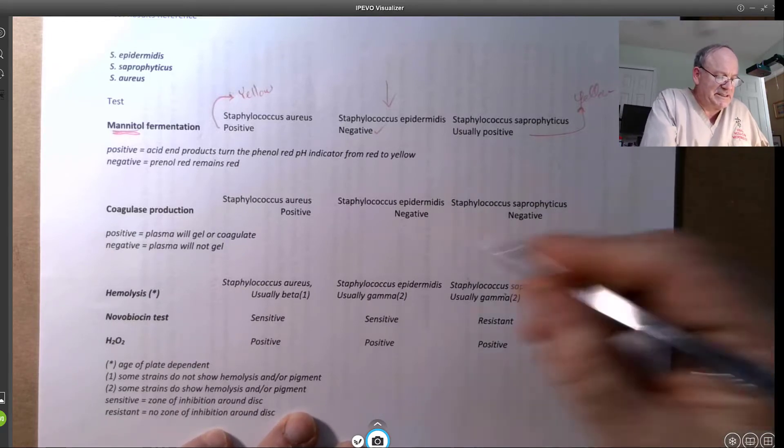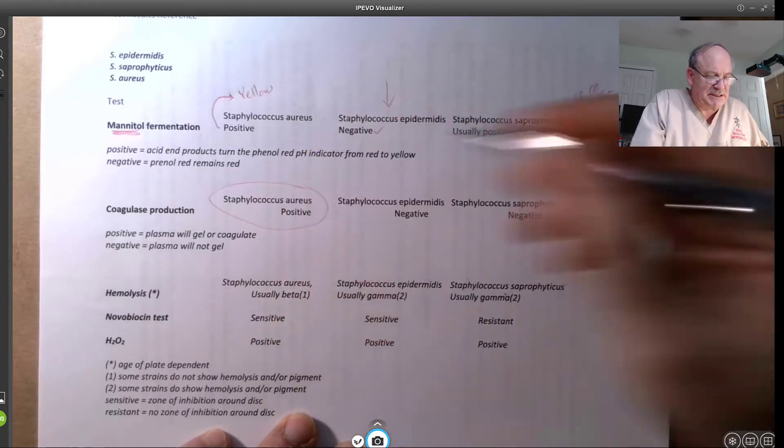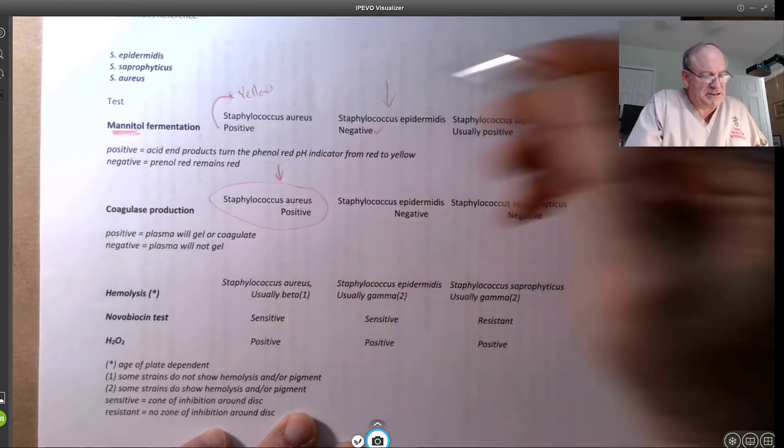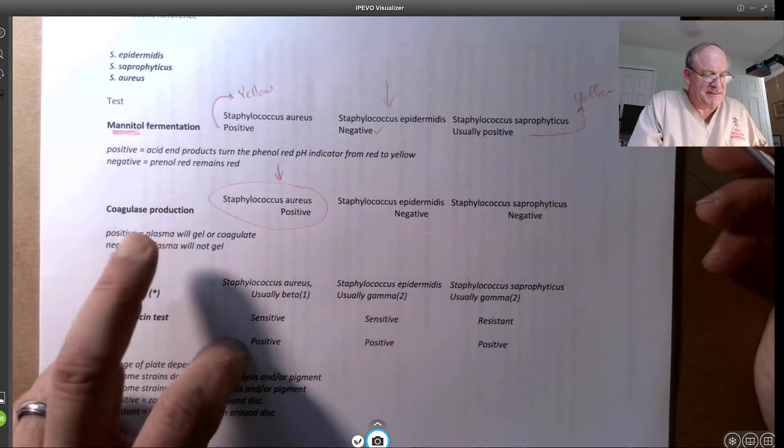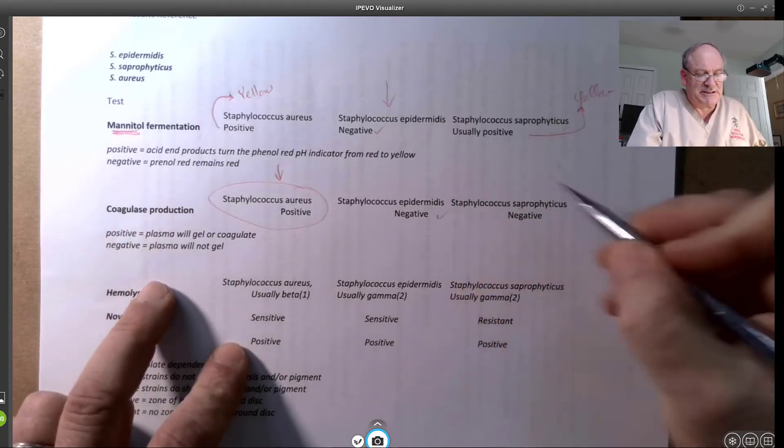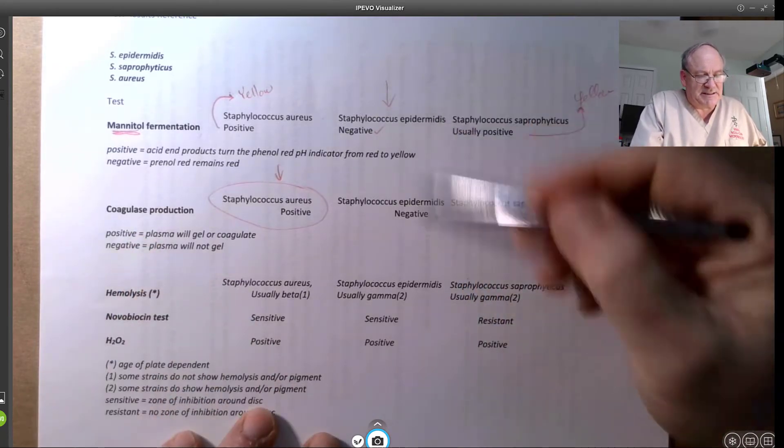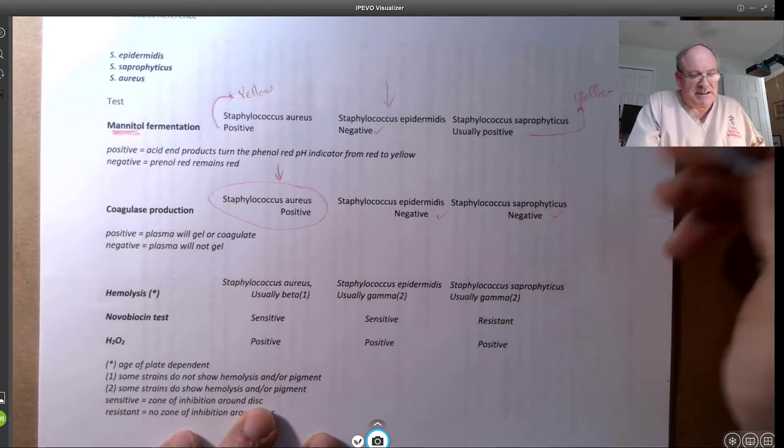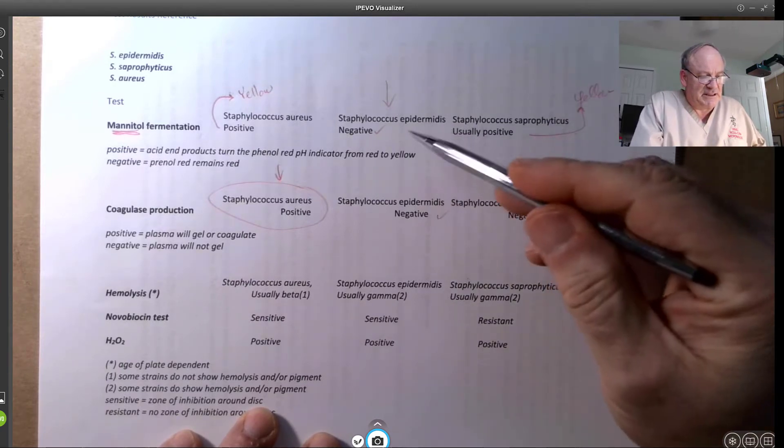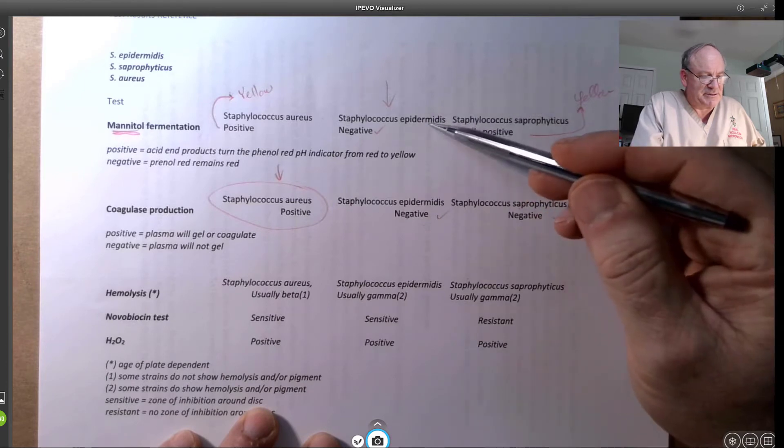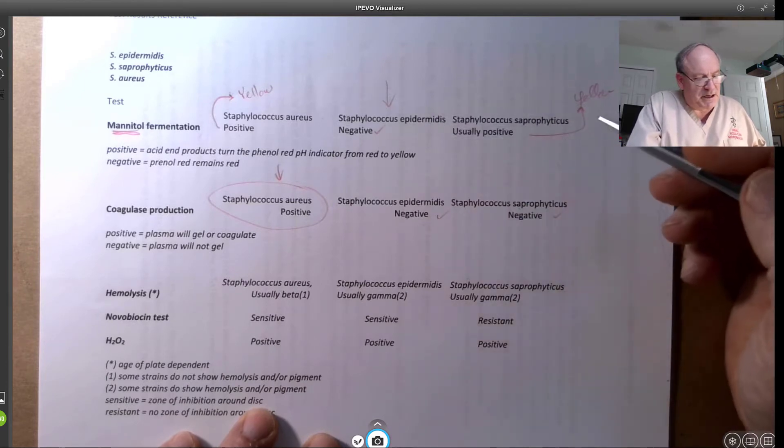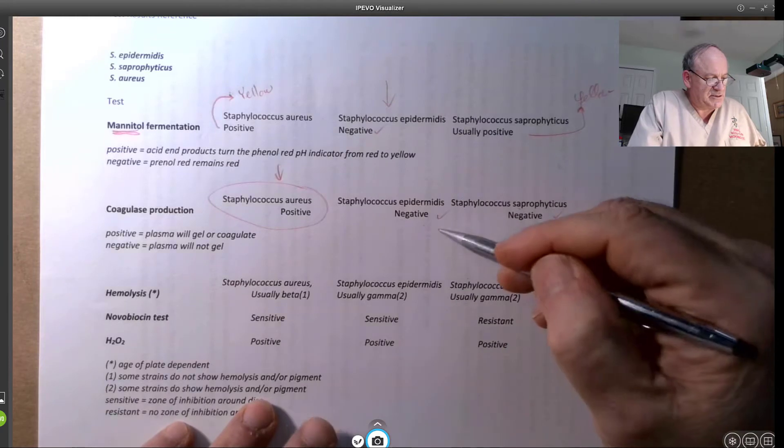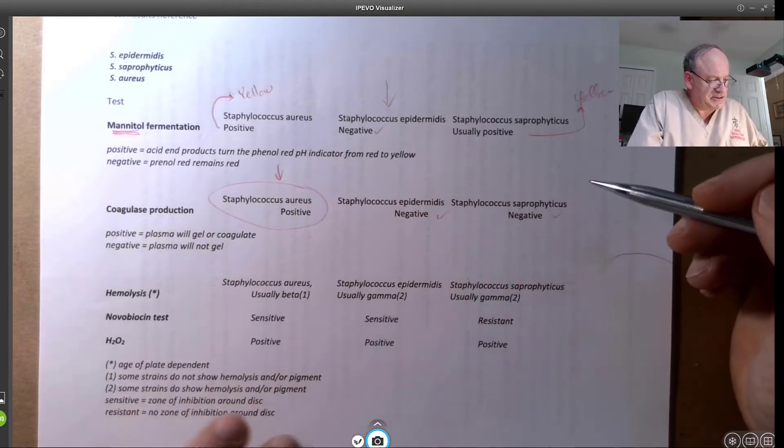And again, we see Staph aureus is separated as the one, so it helps us to identify these two, in difference to the top ones here, allows us to segregate out the Staphylococcus epidermidis from the Staph aureus, which is really powerful. And so you can see these results.